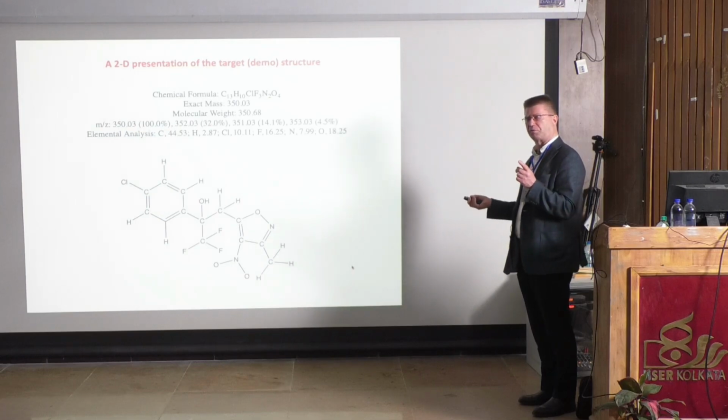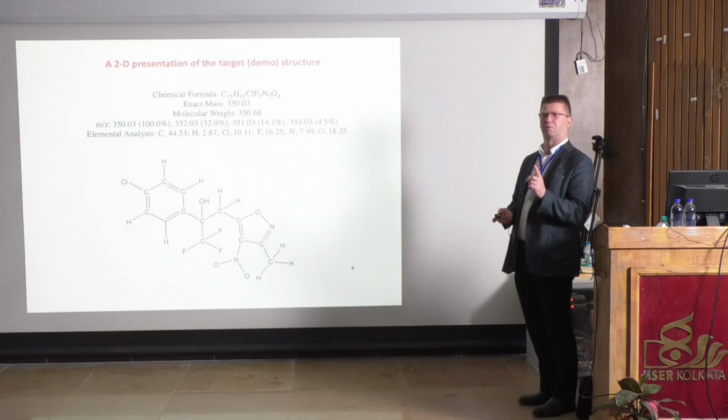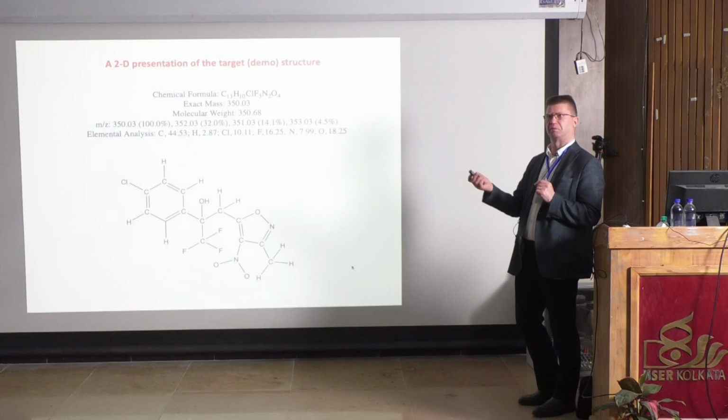So as I told you, X-ray diffraction is the only method which can reliably tell you what it is. Is it this one or that? That's the beauty of this.